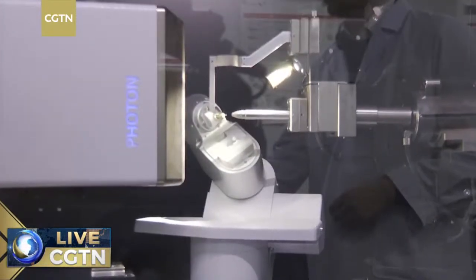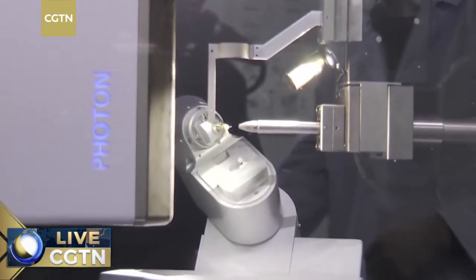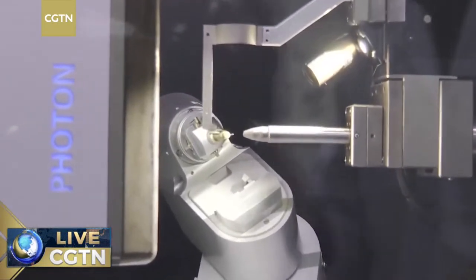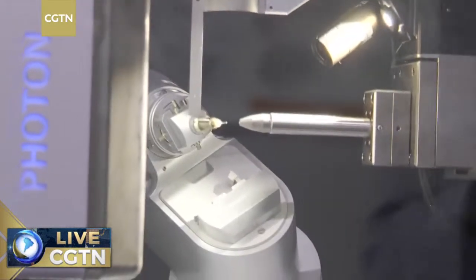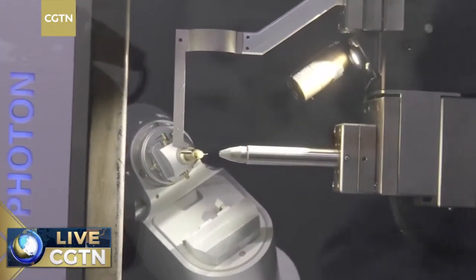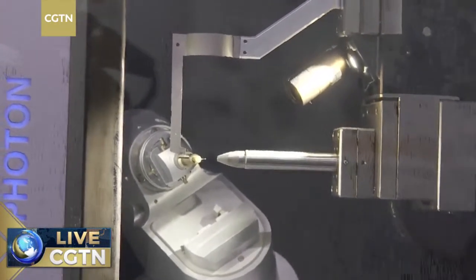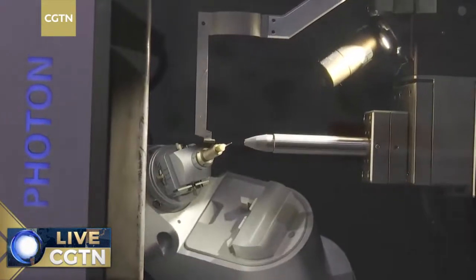我们测试这个数据是用了两天多的时间，然后解析它的。解析这个数据用了一个多周，但是前期的样品制备的环节就非常长。So actually, the analysis with this machine only took about 2 days, and the following tests took about another week. But the preparation for this process took a long time.